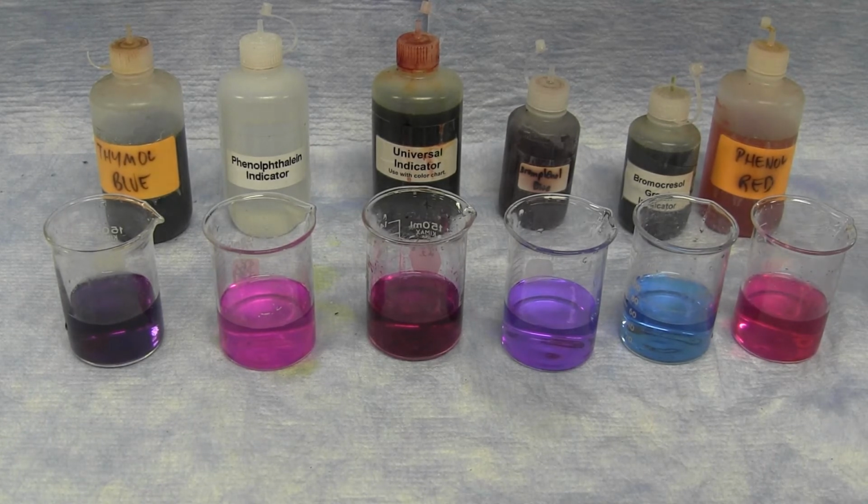However, each of these indicators will change color at a different pH. Knowing what the equivalence point is dependent on knowing which type of indicator to use, which will change color at approximately the pH of the equivalence point.